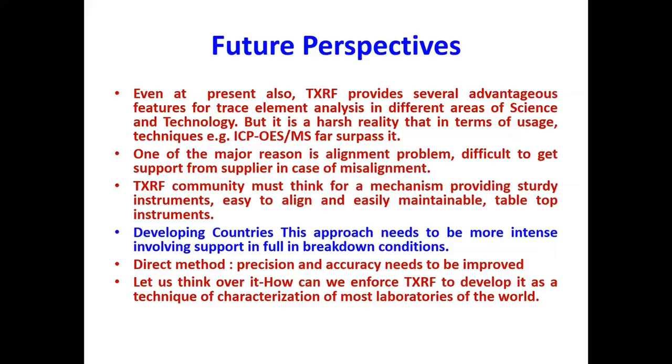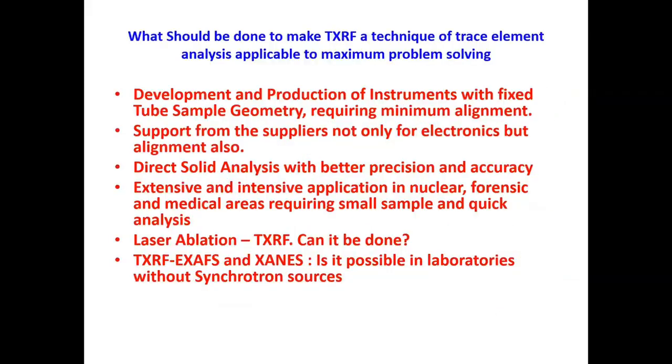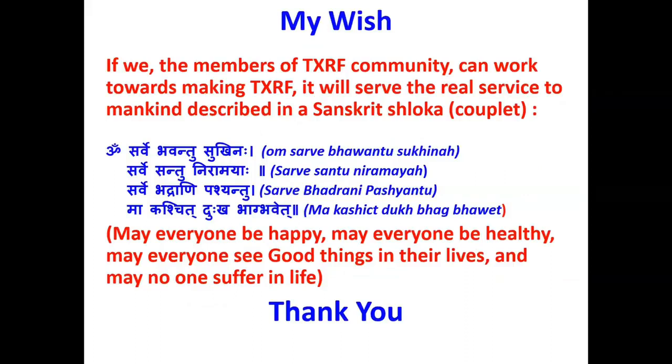But it is a harsh reality that in terms of usage, techniques like ICP-OES and ICP-MS far surpass it. One of the major reasons is the alignment problem. Difficult to get support, I have told. And we as a TXRF community must think of a mechanism for providing sturdy instruments. For developing countries, this approach needs to be more intensive. Direct methods, precision and accuracy need to be improved. Let us think over it and how we can develop TXRF as a technique for characterization in most laboratories of the world and for the betterment of the life of mankind.